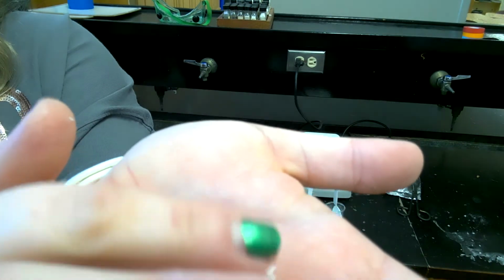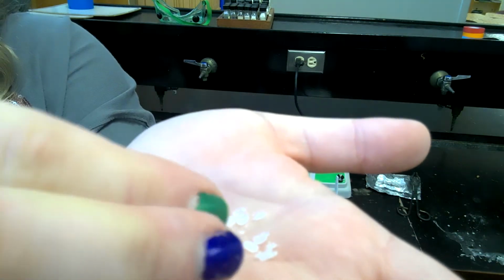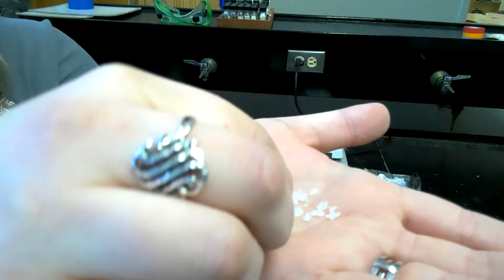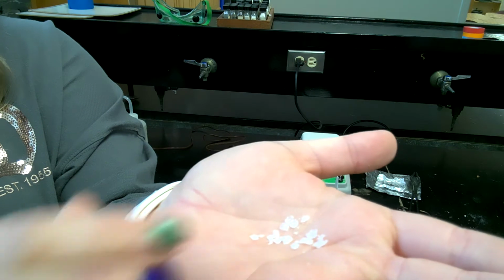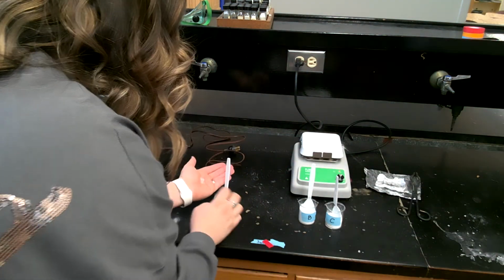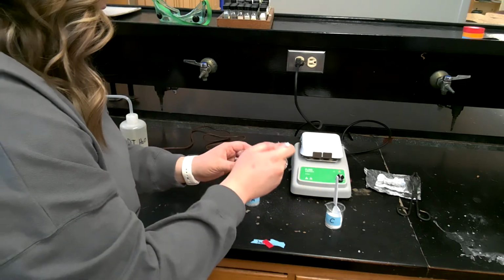Okay, so what we have here for substance A is it's a very waxy kind of texture. It's very soft. It feels like it's just kind of falling apart in my hand whenever I pick it up. And its appearance is white. So that's substance A. Now here's substance B.